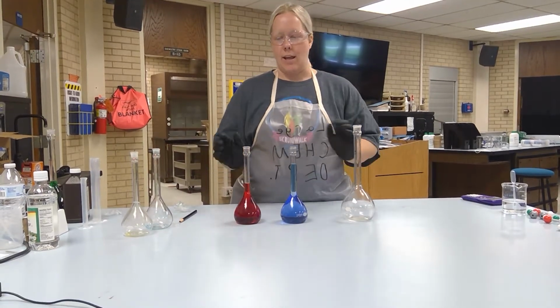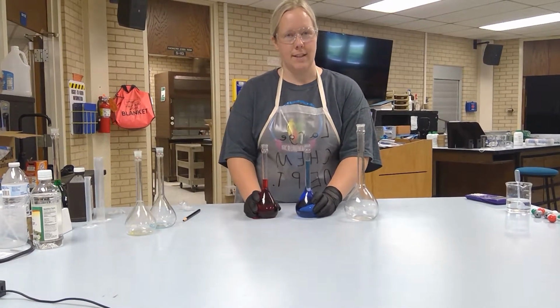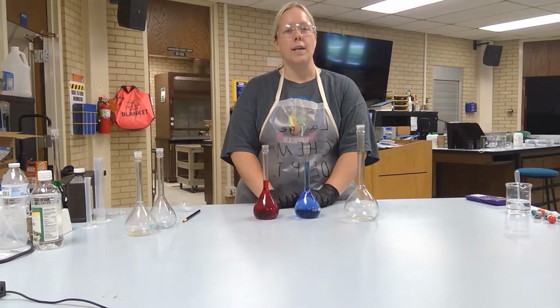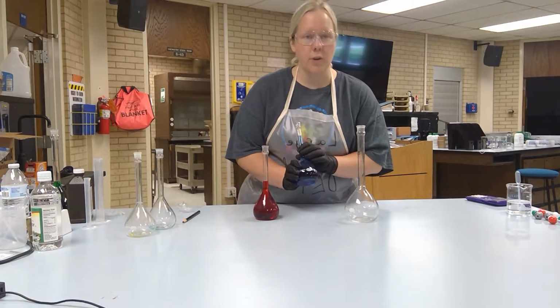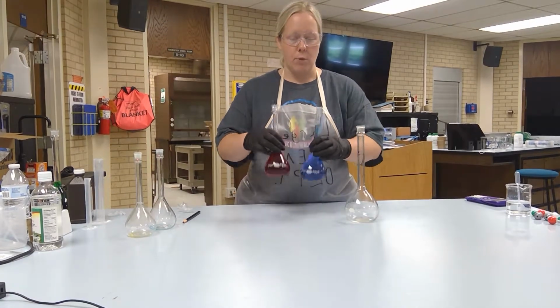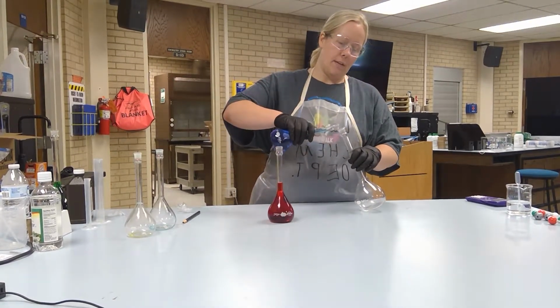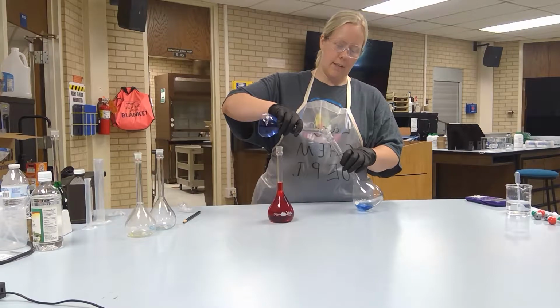Okay. And as with part 1, you saw when we mixed two solutions together that the volume was less than 500. So I want to see, is there an example where if I mix these two volumes, it would give me a volume larger than what I would expect? So I have two 250 milliliter solutions in these two volumetric flasks. So ideally what somebody would think is that if I mix these two together, I should get 500 milliliters. But what I want to prove is hopefully that maybe I can get something different.